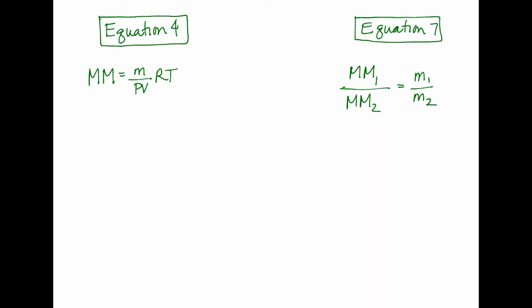In this lab, you'll be given data so that you can calculate the molar mass of a gas using both equations. And just a reminder, when you're doing your calculations, the mm's are molar masses, and the little m's are a measured mass.